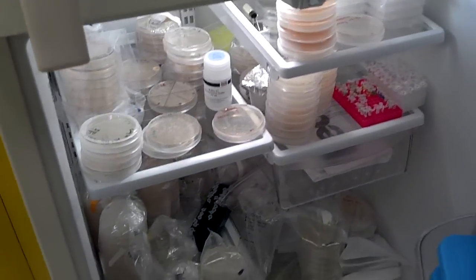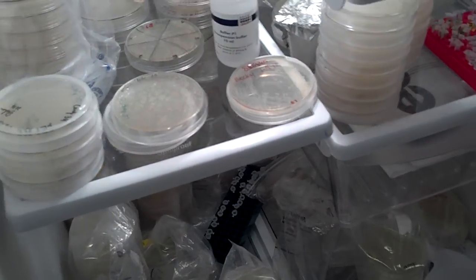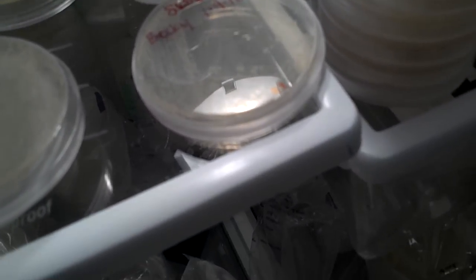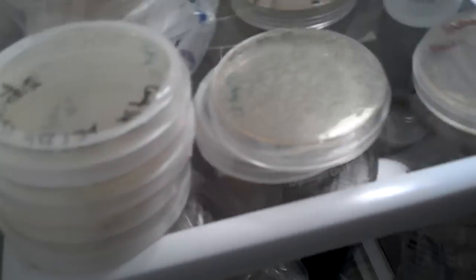This is where we keep our plates. You can see our plates. If you look right there you can see bacteria growth on the plate. See those little dots. This is my plate. You can't see shit though, but there's actually bacteria, many colonies of bacteria growing there, which we take and inoculate media, grow it, spin it down, then digest it.